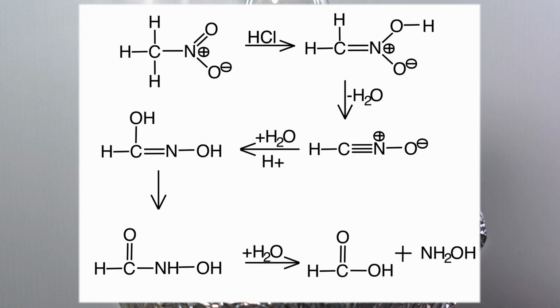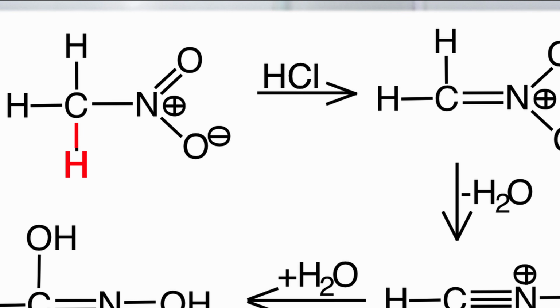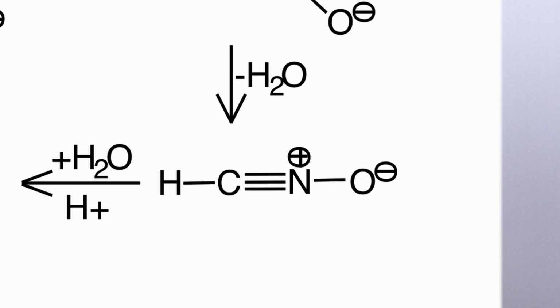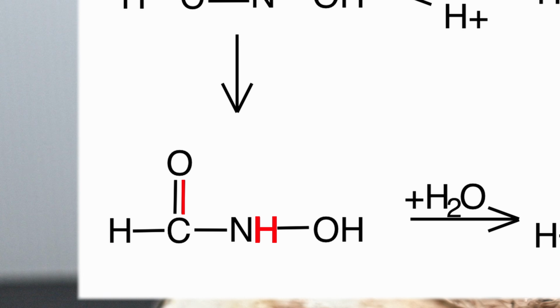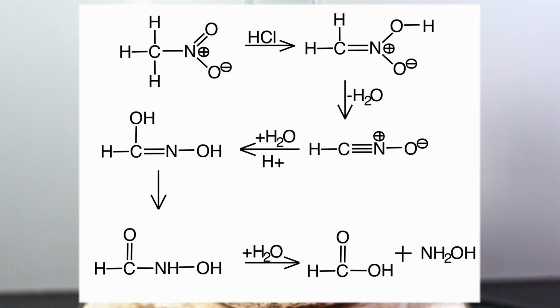Now what's going on has generally been an enigma, with some parts filled in and other parts left out, until now. First, the nitromethane converts into its acidic tautomer. The high heat combined with acidity catalyzes a sort of rearrangement, transiently forming a nitrile oxide, before water reacts with it. The molecule rearranges into formic hydroxamic acid, which is then hydrolyzed into formic acid and hydroxylamine chloride.